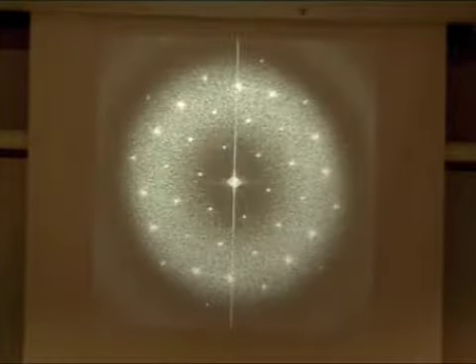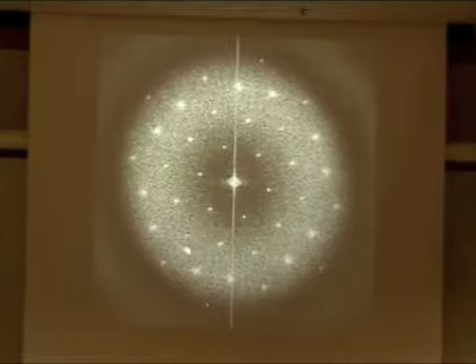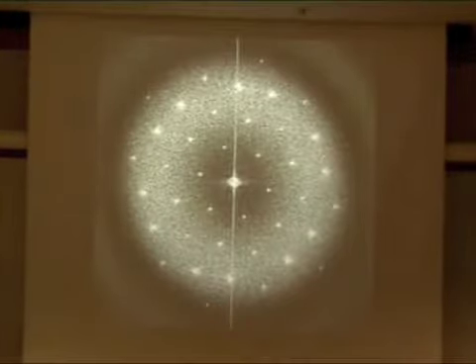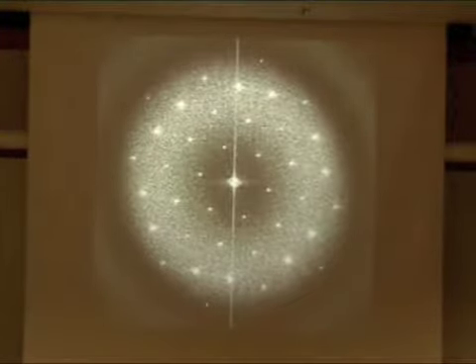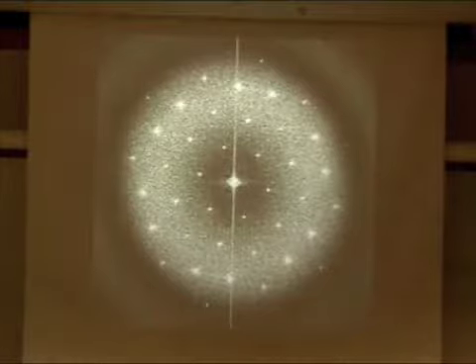We do a mathematical transform, this Fourier transform that Bob went over this morning. That is not mathematically accurate, but it's designed to give you the idea. And you can see immediately, oh, okay, there's where the information is. So in a way, this is kind of a better representation for the data that we're looking at. These spots say, okay, there's a frequency component here of a certain resolution, certain amplitude, certain phase. And when you put all of those together, you get some kind of structure or some sort of protein, or whatever it is you've imaged that is regular. And the reason that it's a lattice is exactly what I was talking about, that there's some sort of repetition in your image.